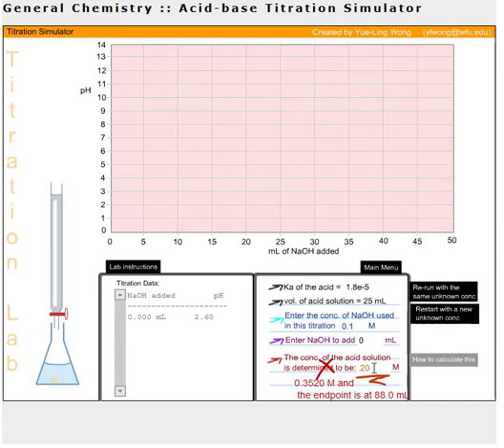So if you want to try it again, you can always rerun with the same unknown concentration. But if you want to test yourself and do a different concentration, it's the same equation, but a different concentration, you can restart with a new unknown. And that way you get a fresh problem and you can give yourself basically unlimited practice with doing titration calculations.